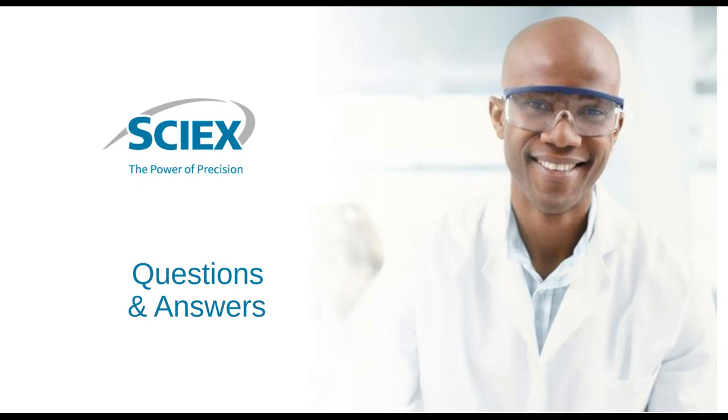I think from my work over the last few months, looking at the second part of the question, the protocol is probably similar to SDS page for sample prep. It's really very similar. You don't need any extra reagents. It might possibly be a bit quicker than SDS page preparation.